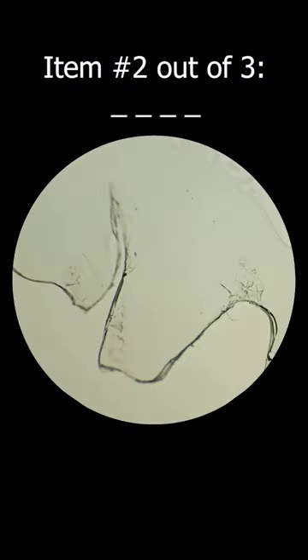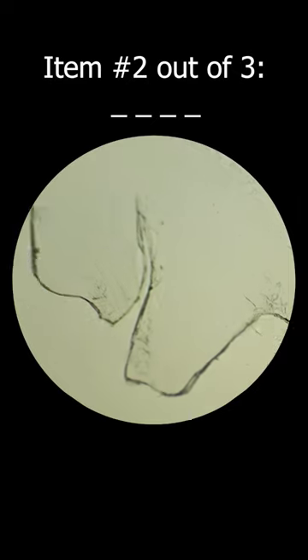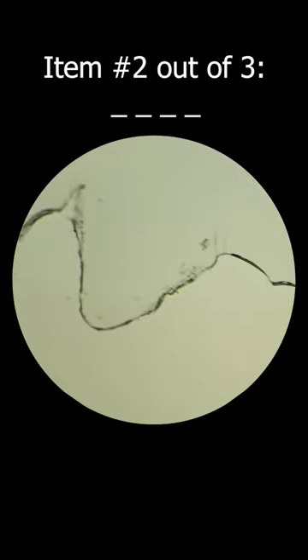Moving on to the next round, this one should be slightly more difficult. At first glance, it's definitely jagged and has some repeating peaks, although they don't always look the same.